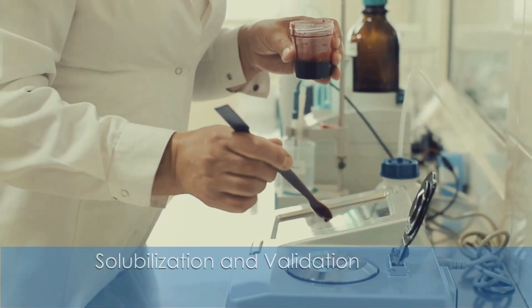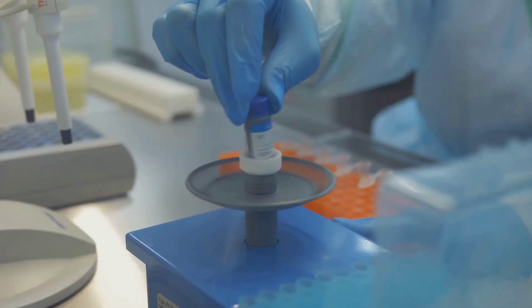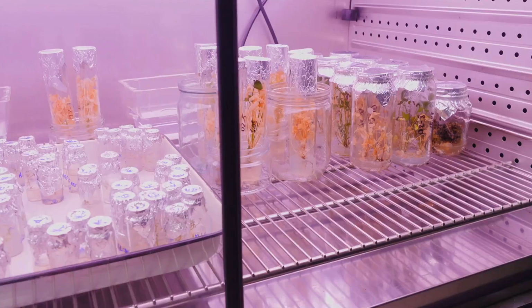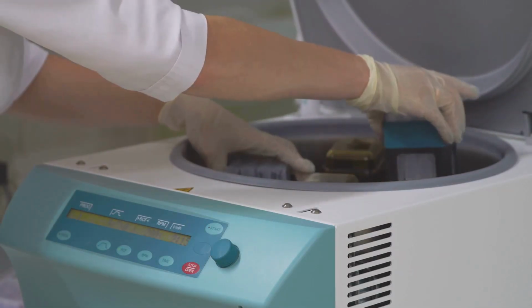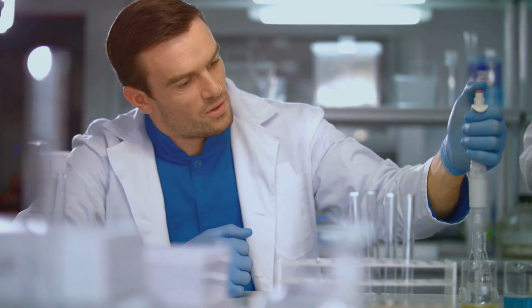Time for solubilization. Be gentle. Add your buffer to the membrane pellet and resuspend carefully. No vortexing. Incubate at 4 degrees C for 30 minutes to 2 hours. Centrifuge at high speed to separate solubilized protein, supernatant, from debris, pellet. Collect the supernatant. This is your protein.